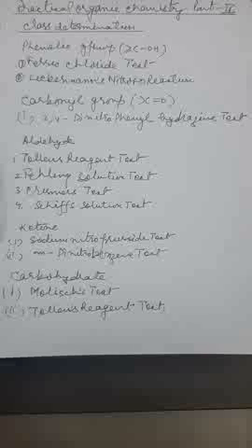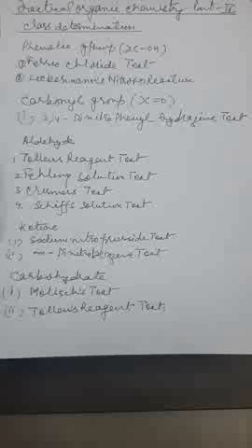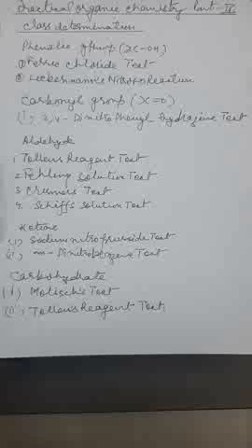Good morning. Today we will discuss organic chemistry practical in B.Sc. Part 2. In the previous class we discussed class determination. The properties of an organic compound depend on the type of the functional group present in it.